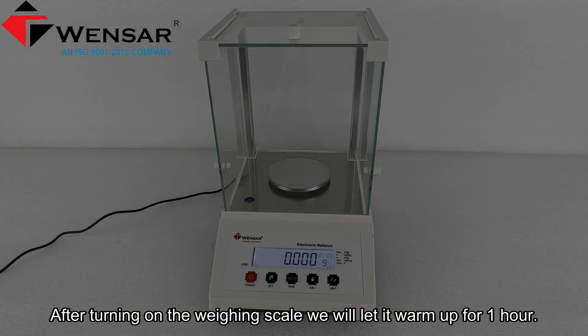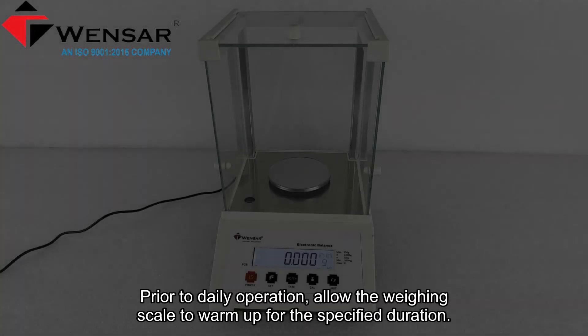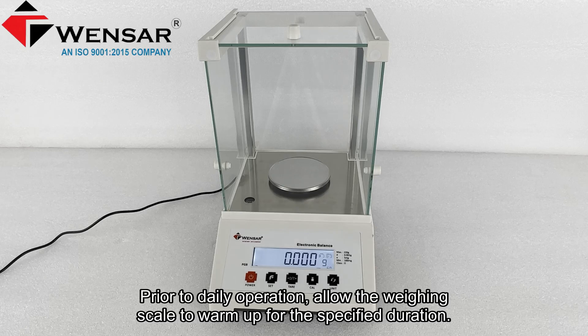After turning on the weighing scale, we will let it warm up for one hour. Prior to daily operation, allow the weighing scale to warm up for the specified duration.